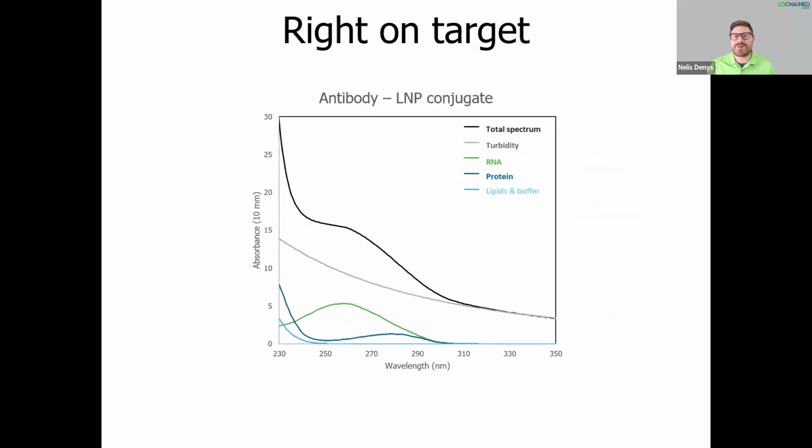And we already talked about how complex LNPs are and how that results in a lot of room for optimization. Now, researchers are trying to improve targeting in many forms, passively by playing with size and composition and such, but also actively by adding on targeting ligands like antibodies or antibody fragments or other options.